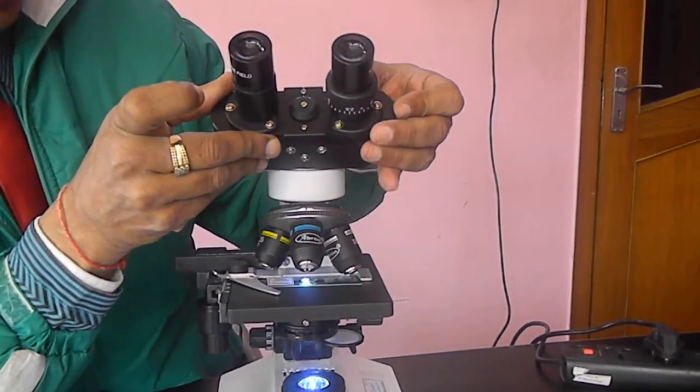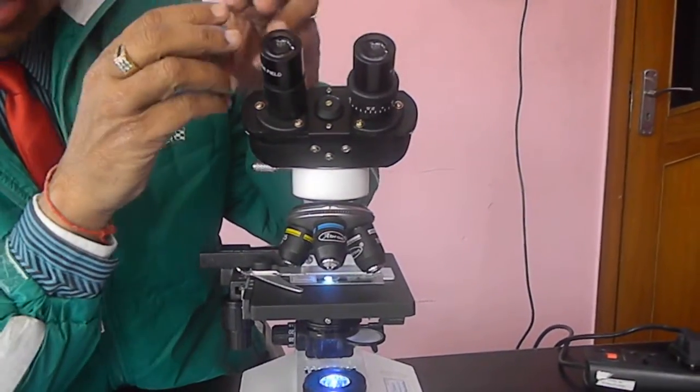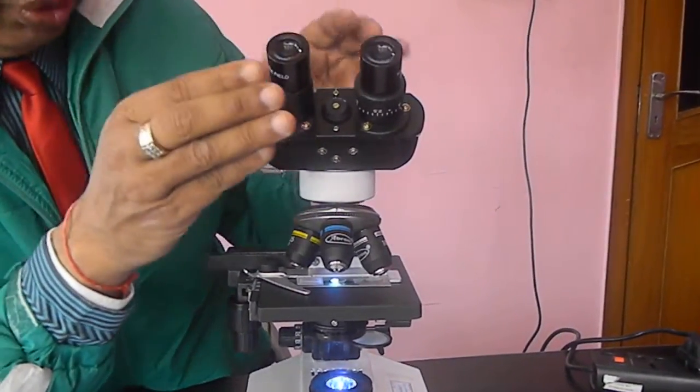Then adjust the interpupillary distance so that the distance between your eyes is having the same image from left as well as on the right side.